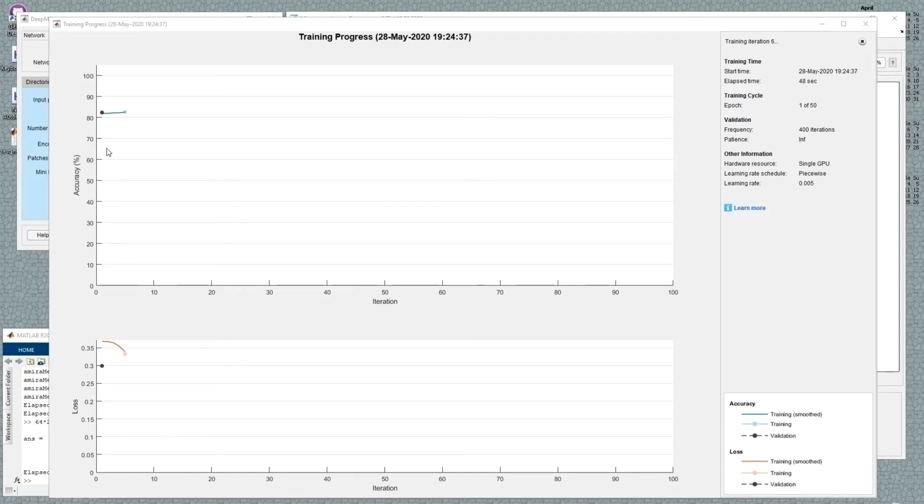Okay, so the training started, and normally it starts from the last point of the network. We did this training for not as many iterations as I would like, but let's take a look at the results. For now, I'll stop the network training again, and then we will try to evaluate what we have there.